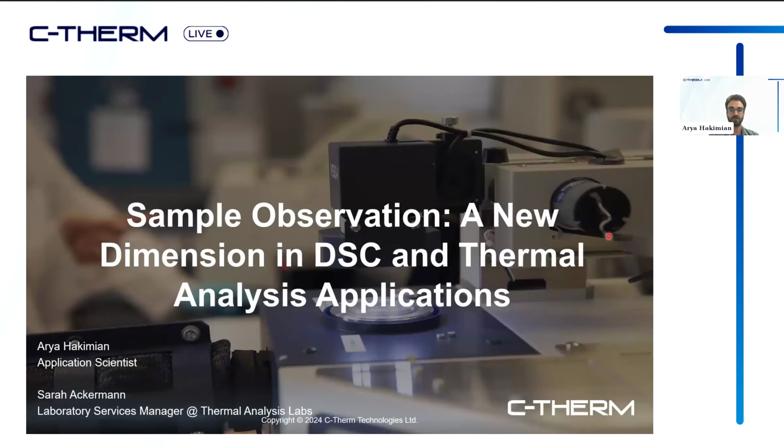So welcome and thank you for joining today's webinar. My name is Arya Hakimian. I'm an application scientist here at C-Therm Technologies. Later on in the session, I will be joined by my colleague, Sarah Ackermann, who is our Laboratory Services Manager at Thermal Analysis Labs, who will be taking us through the bulk of today's session. So today, the title of our webinar: Sample Observation, a New Dimension in DSC and Thermal Analysis Applications. We'll be going into that in further detail throughout the session here.